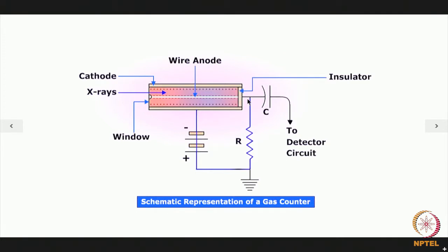This is an insulator and this is a resistor that is kept outside the gas counter.